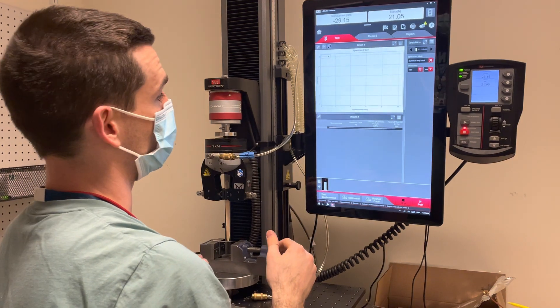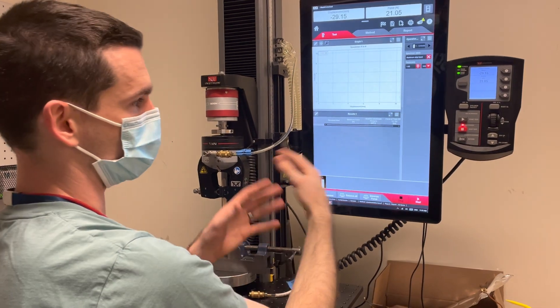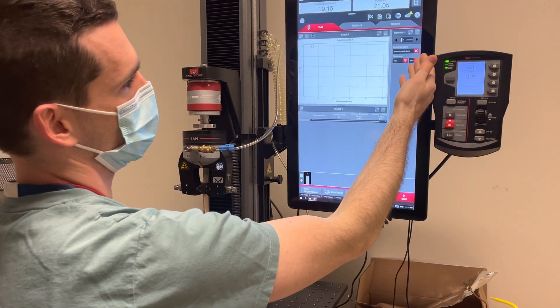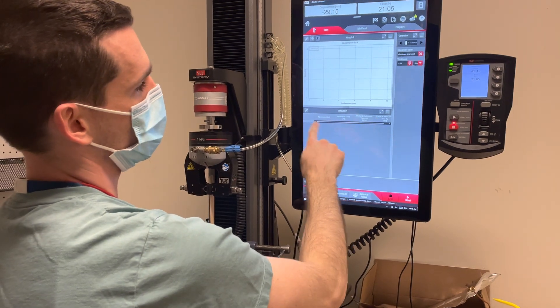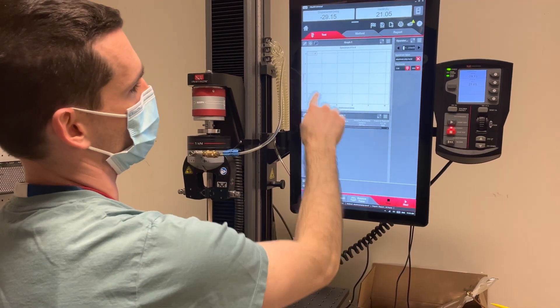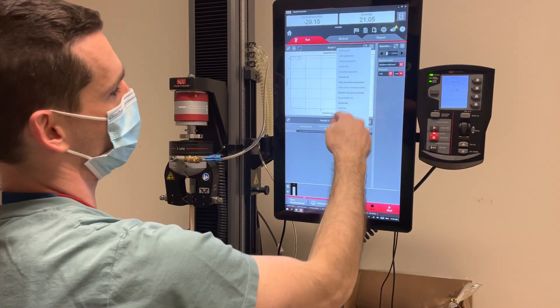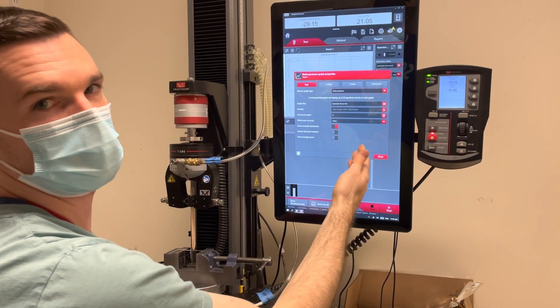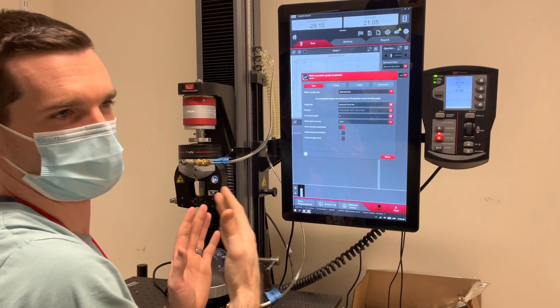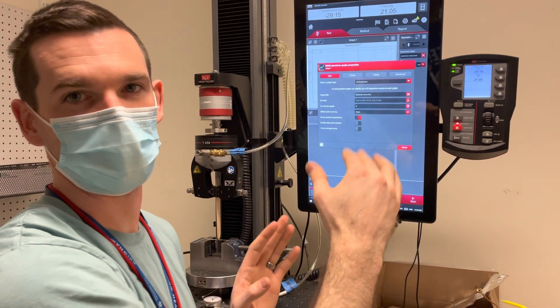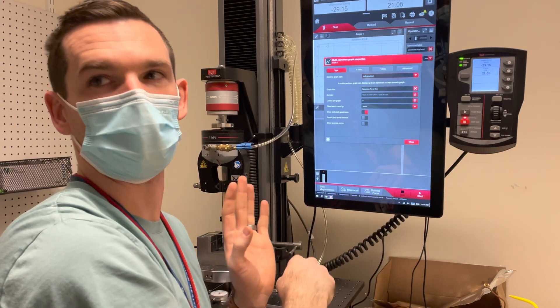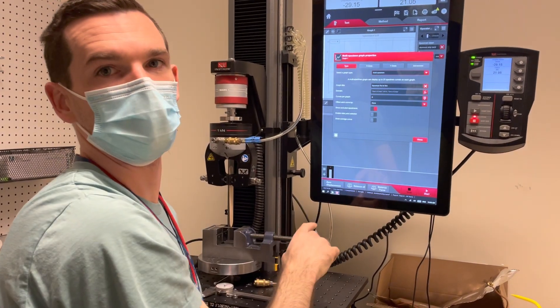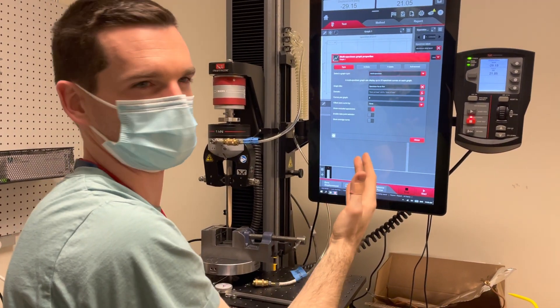This is what the screen looks like for all the things I picked: here are my operator inputs, here's my results table, here's my graph. If you want to edit how many samples appear on the graph — say you test four samples and then test sample five and the earlier graphs disappeared — that's because your number wasn't high enough here. I think there's a max of about 21.